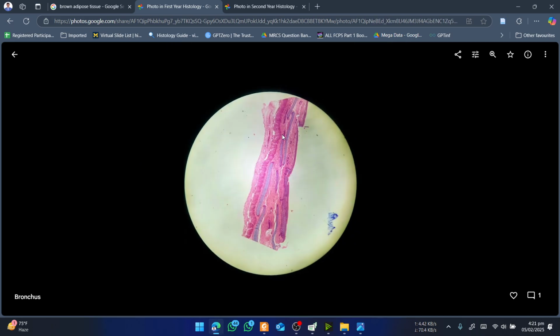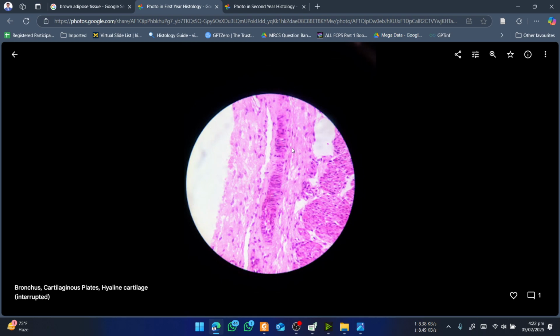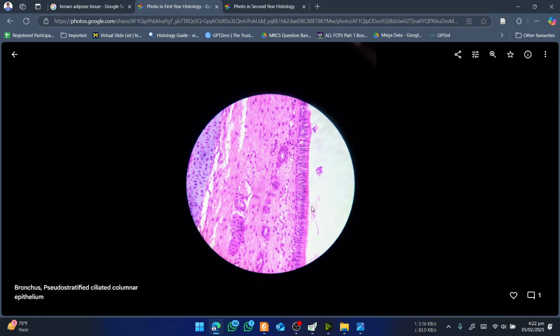It is usually shown to you in the picture of larynx. It's in the trachea, it's very easy to show you this area is hyaline cartilage, this area between them, this is the hyaline cartilage. This is the hyaline cartilage. You can see the very small perichondrium is present here. That is the hyaline cartilage part, and that's perichondrium again. It depends upon the exact slide which you are seeing.